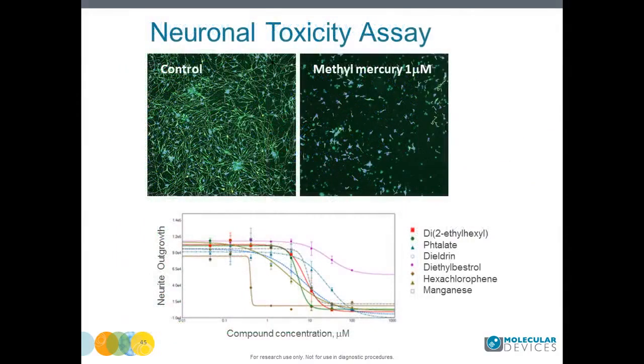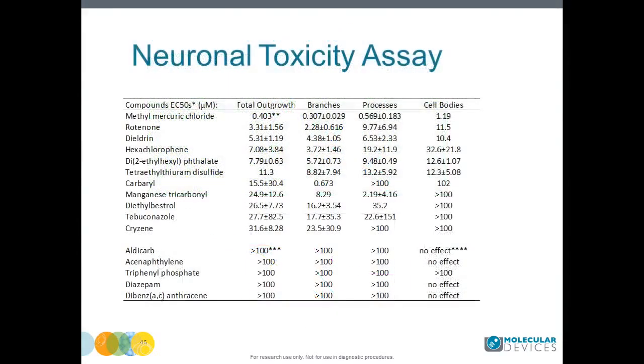We have created IC50 plots for multiple readouts. The IC50s for multiple measurements presented in the table. Notably, the IC50s were different for different readouts. For example, IC50 for branching were typically the lowest, and for cell viability significantly higher than the outgrowth, branching, or processes. So, stem cell-derived assay models in combination with advanced imaging methods can be a very efficient tool for toxicity evaluation.